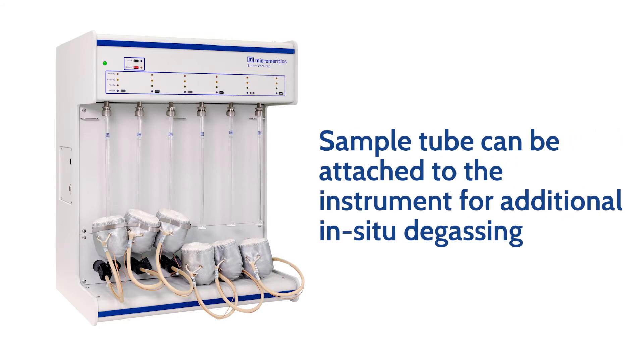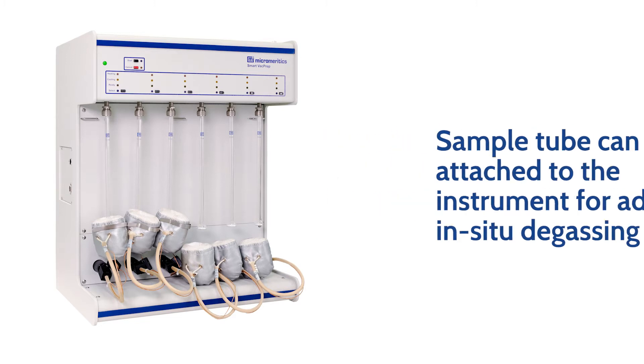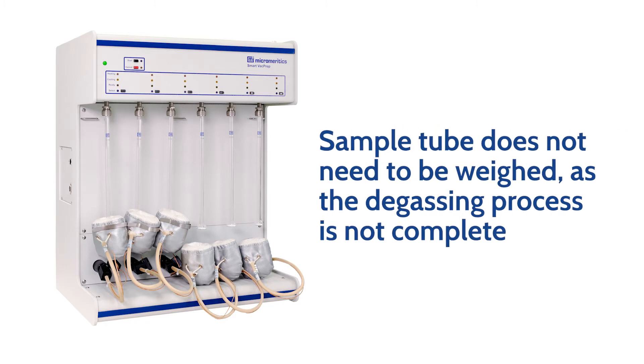The sample tube is ready to be attached to the instrument to continue with in situ degassing. Weighing the sample tube is not necessary yet since the degas is not complete.